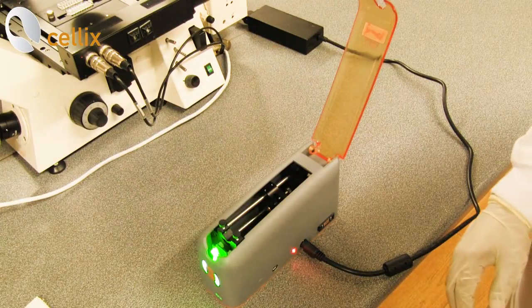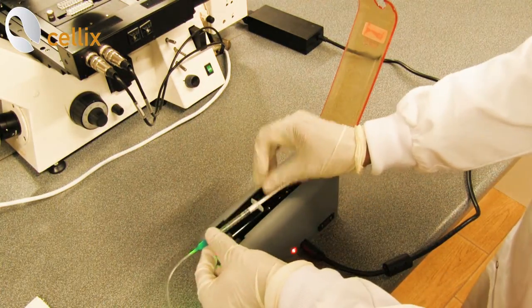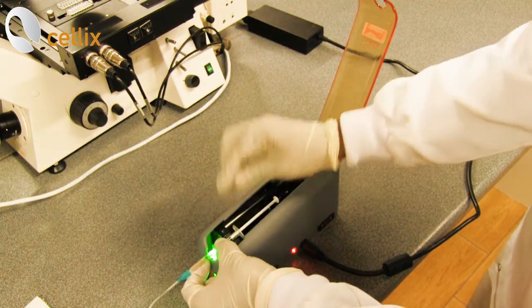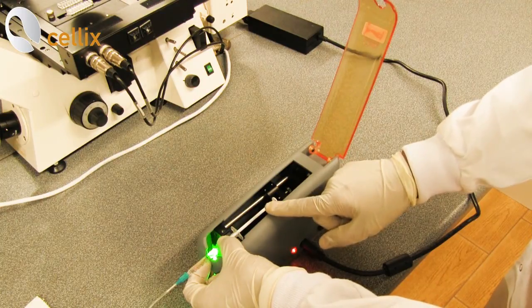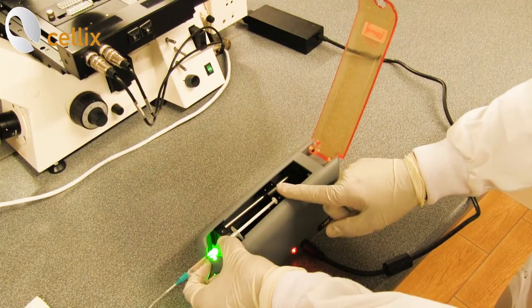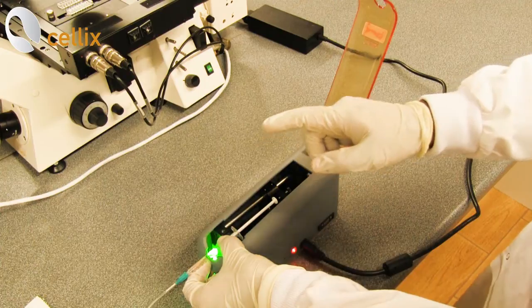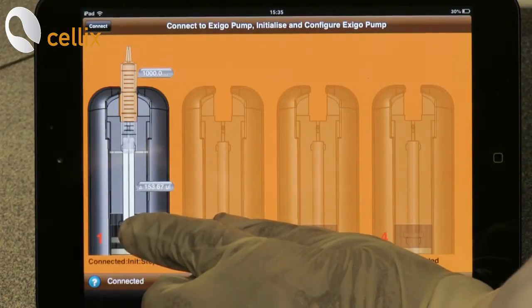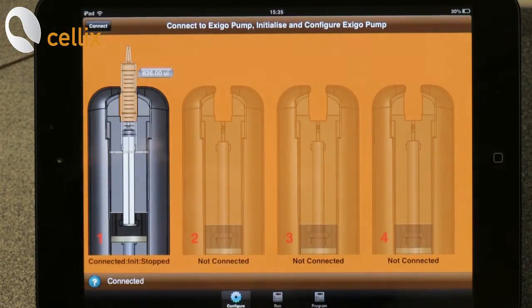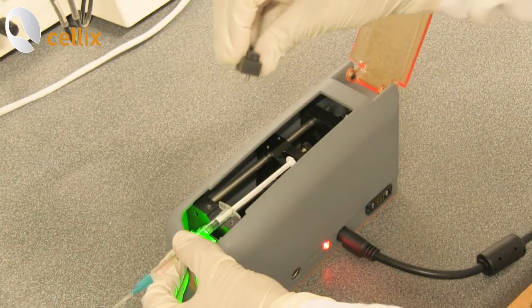Next we have to connect the syringe into the syringe slot. For that you remove the holder, put the syringe in. You can see the plunger is a little far, so we have to adjust the plunger using the application on the iPad mini. As previously done, we need to move the syringe to set the right position of the plunger. Now the plunger is in position and we're going to clamp it with the holder.